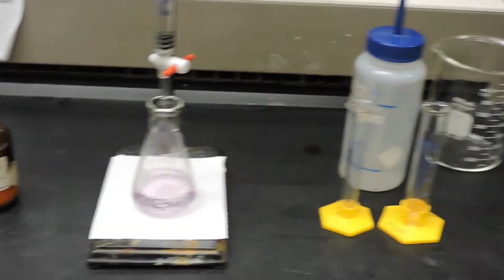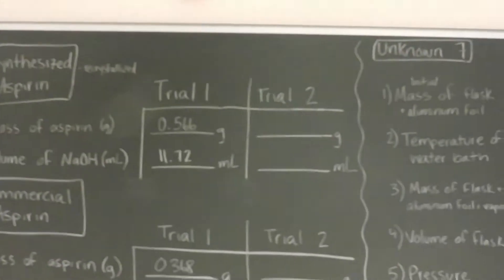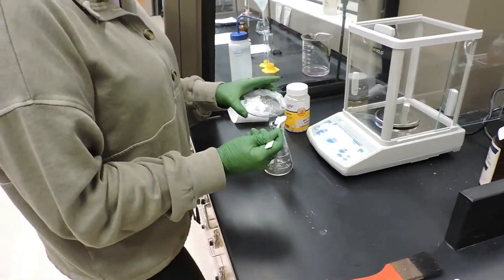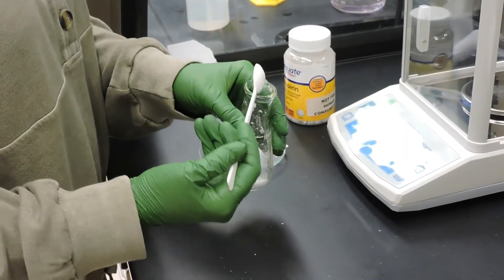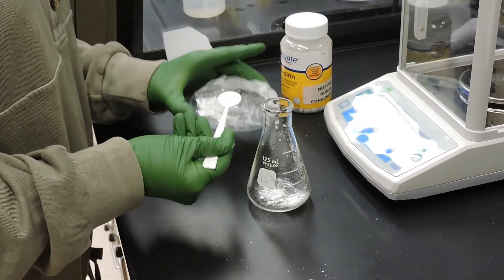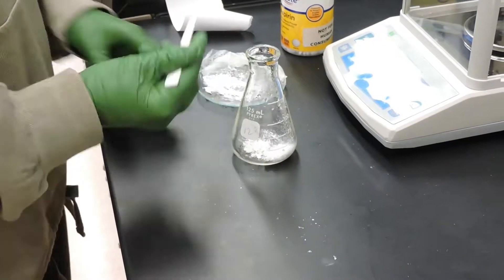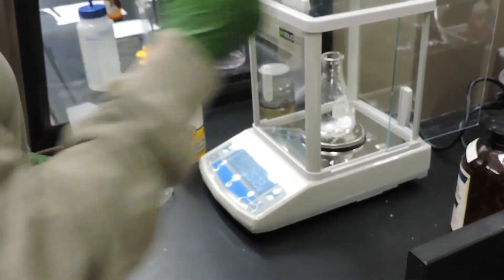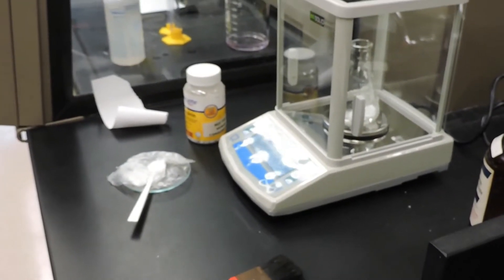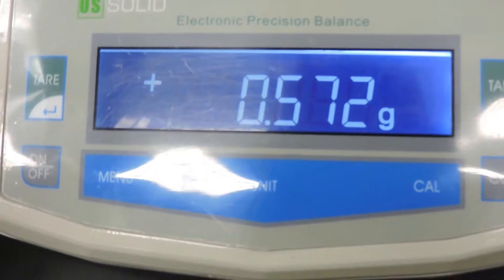We will repeat this titration for another trial. The mass of aspirin for the second titration will be 0.572 grams.